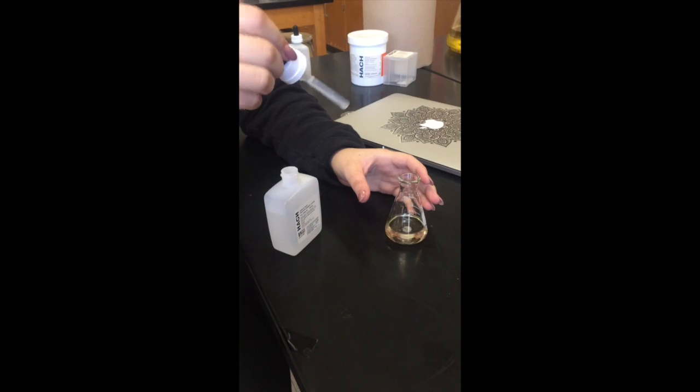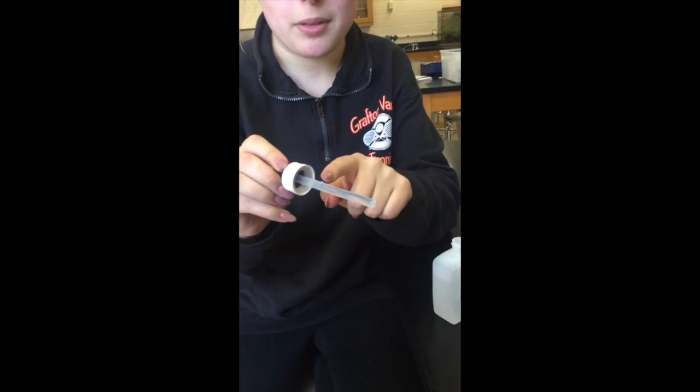Next, swirl, making sure that it's evenly distributed. Add two milliliters of sulfuric acid solution by twice filling the dropper pipette to the one milliliter mark.